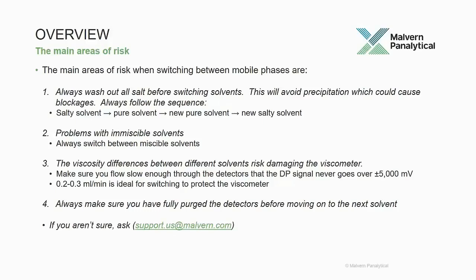Finally, always make sure that you fully purge the detectors before moving on to the next step. Without doing that, you risk leaving some salt in there that might precipitate or some immiscible solvent. Of course, if you aren't sure, email us and ask for help.